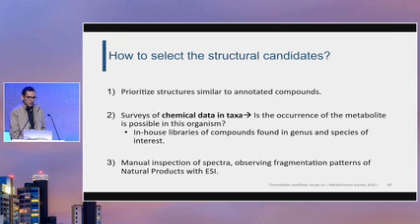In this case, you must have some experience in MS/MS data to identify the gas-phase reaction mechanisms of fragmentation, and identify some patterns of fragmentation, neutral losses of some classes of natural products, as well as diagnostic ions for some classes of natural products. It increases the confidence in the annotations.